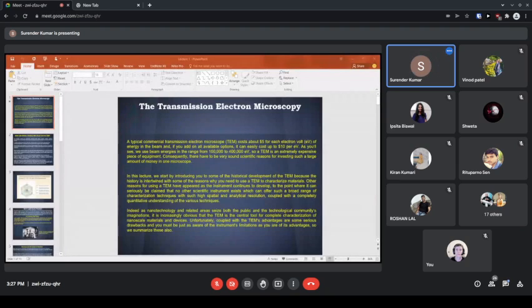The resolving power of our eyes is between 0.1 to 0.2 millimeter, depending on your eye, whether it is good or bad. If you want to go finer, below 0.1 millimeter, then you need a microscope, because we cannot distinguish below that.